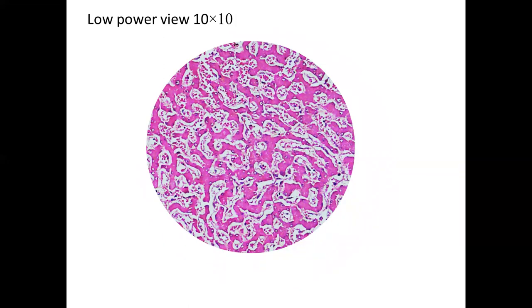Here you see a liver tissue slide in low power (10x). You can see the hepatocytes — plates of hepatocytes — all stained pink because of their cytoplasm, with small purple-stained nuclei. In between the cells, you see a special type of capillary called a sinusoid, which is lined by endothelial cells and contains blood. Between the hepatocytes, you get sinusoids with red blood cells visible inside them.